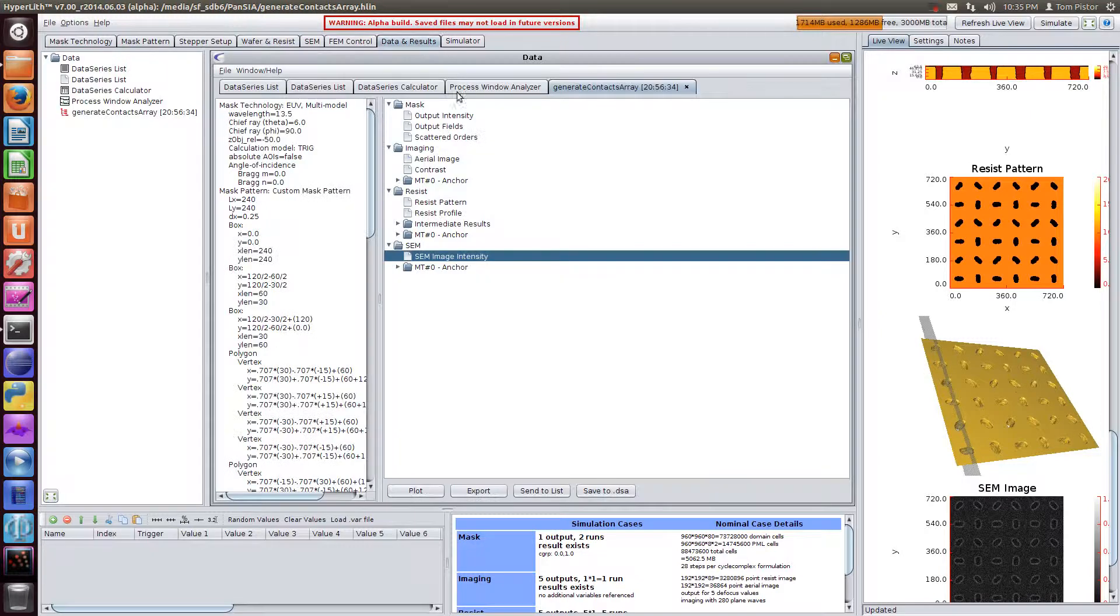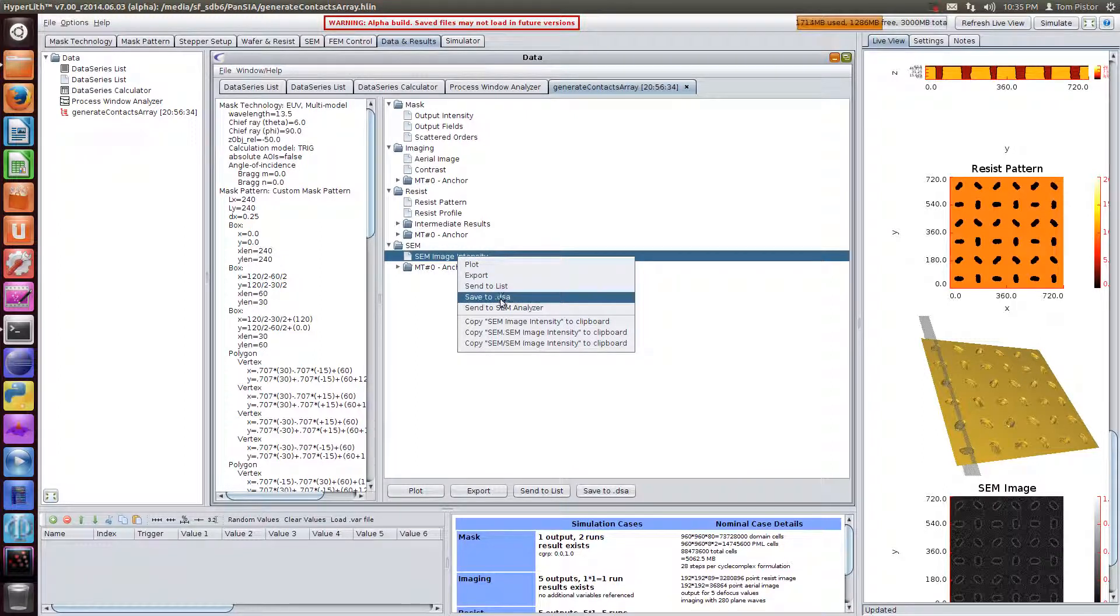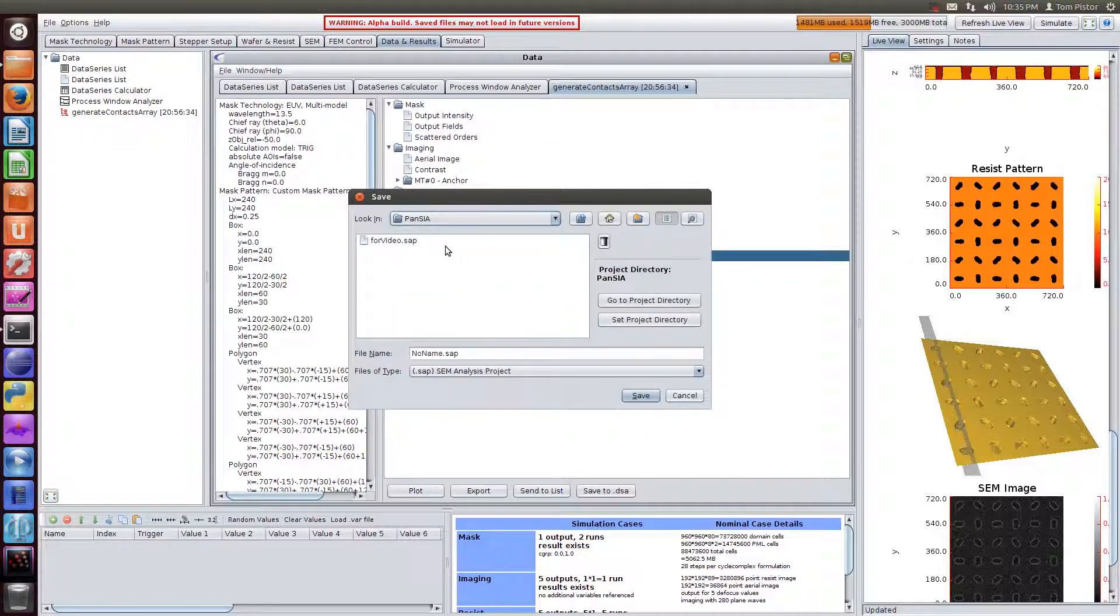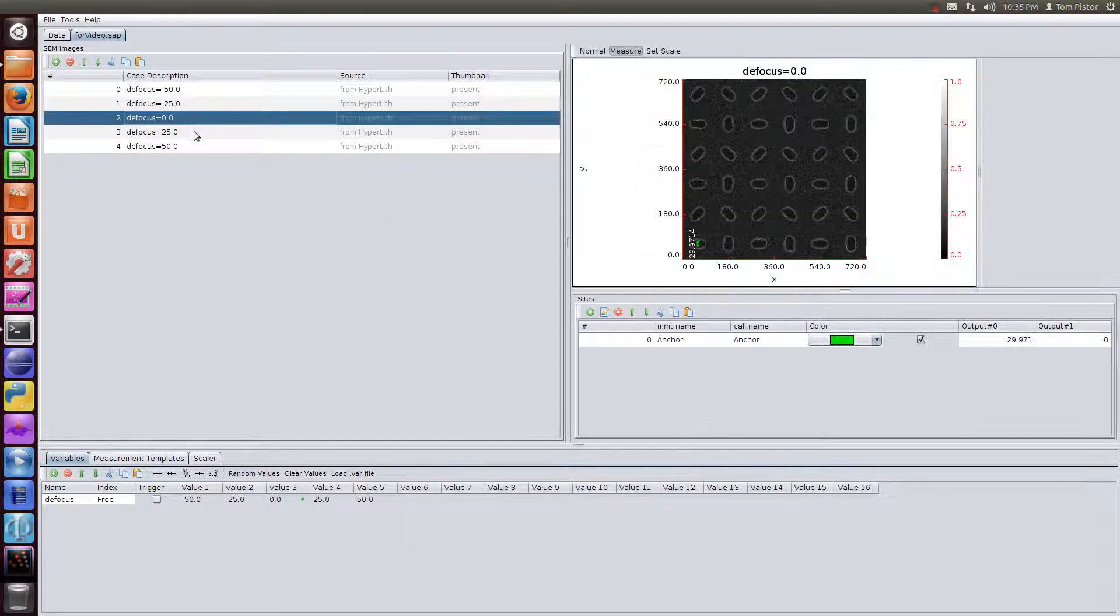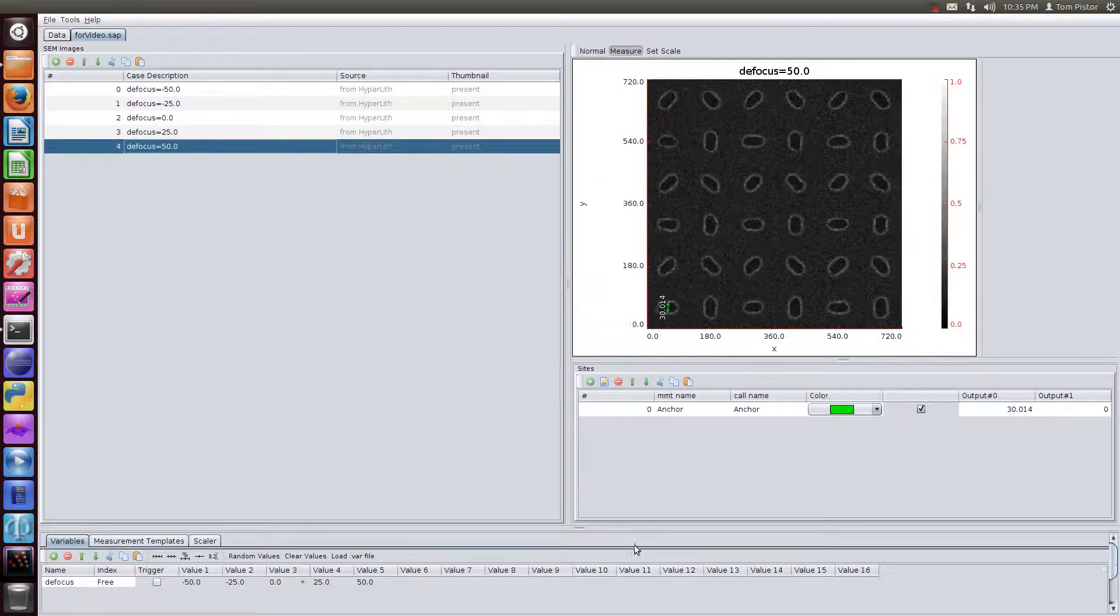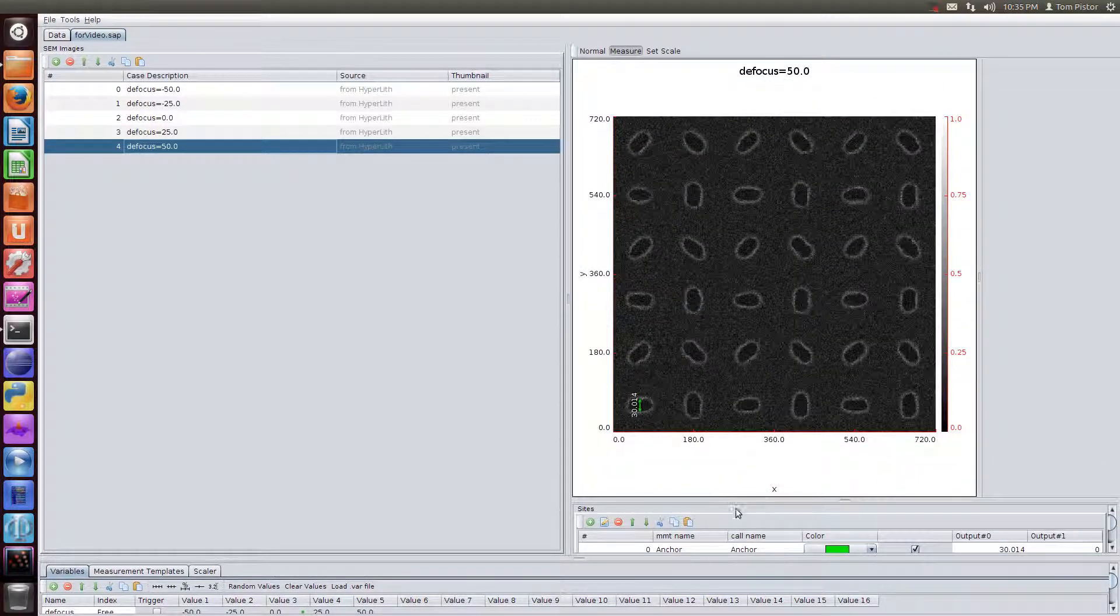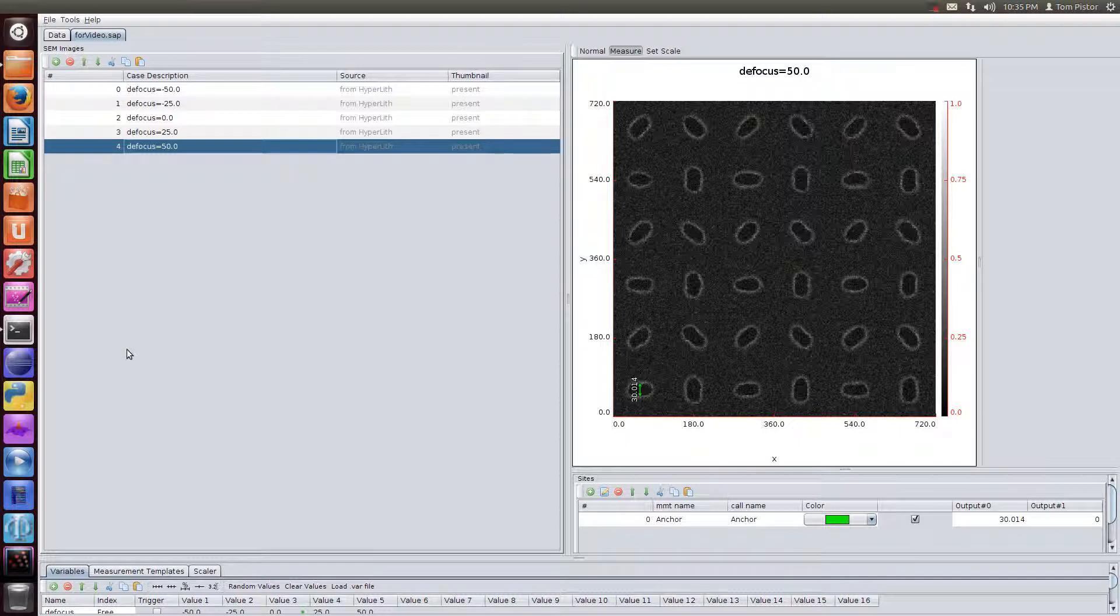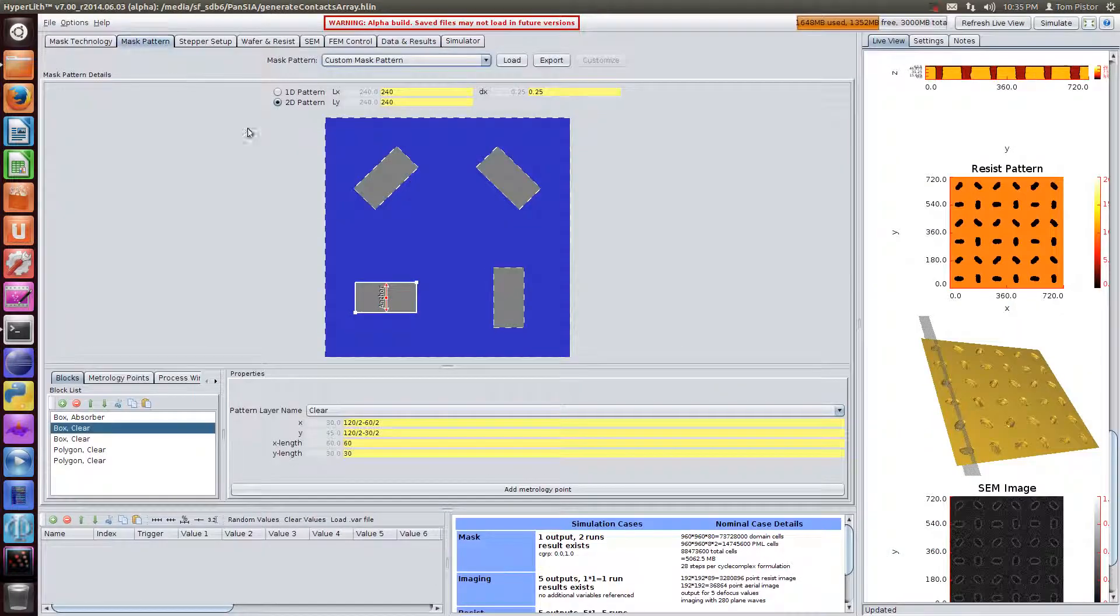I've already run this simulation. It takes a few minutes. We are going to send the SEM images to the SEM analyzer. It's asking us to save it. Now we have our SEM images. You can see that it's already added the metrology point from our hyperlith here.